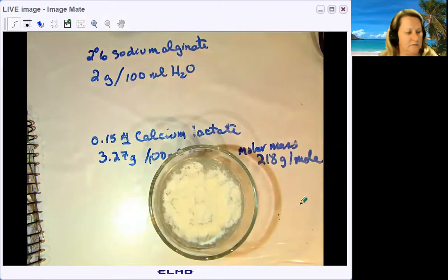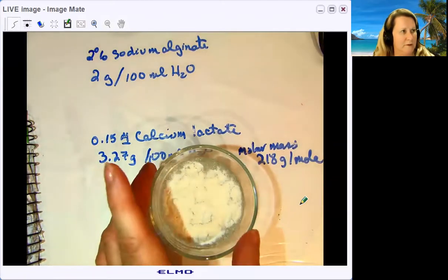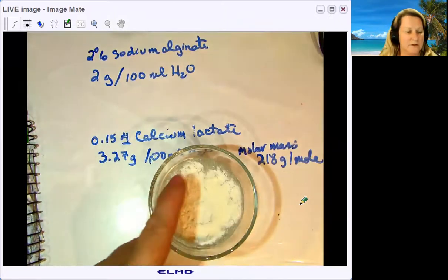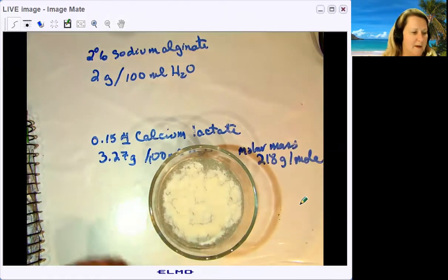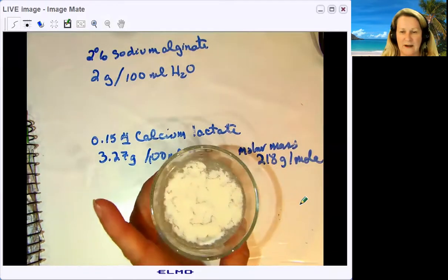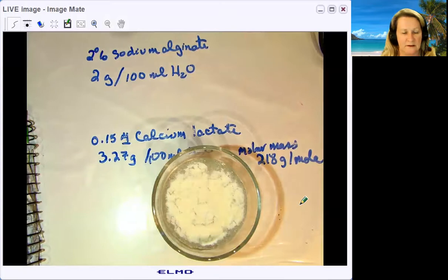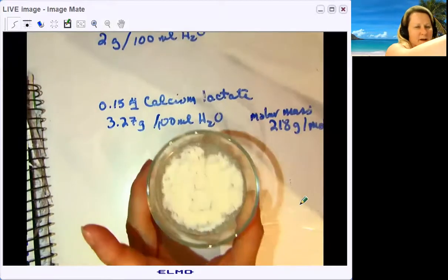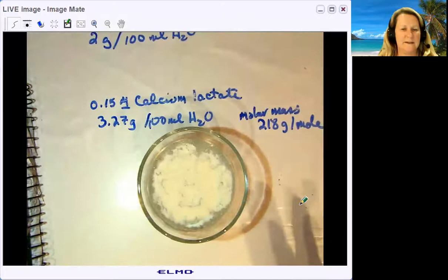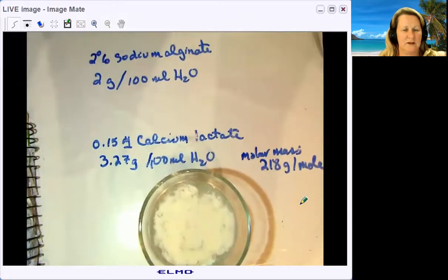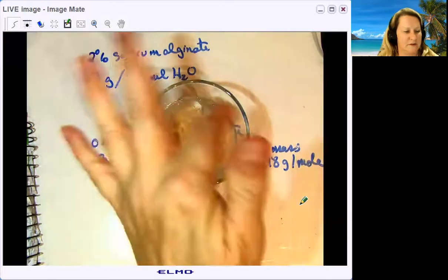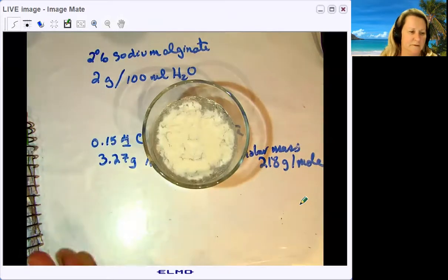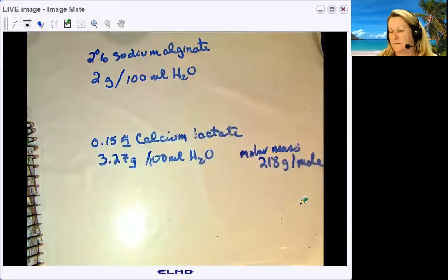What you don't want to do is put it on a stir plate, because you get this vortex and all the powder clumps up in one big thick clump that doesn't dissolve. What I do—I'm going to show you the solution I made a few minutes ago—I put 100 mL of water in the beaker and sprinkle the 2 grams of sodium alginate on top. I did this about 15 minutes ago and you can see it's already starting to dissolve. Do this two days ahead of the lab and it will dissolve beautifully.